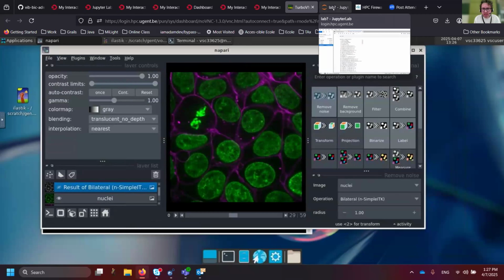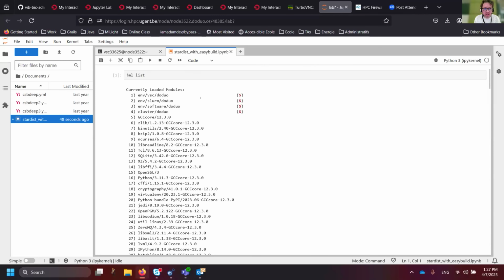Finally, I just wanted to show you one last thing, for those who code a bit or use Jupyter Notebook in Napari. There is a specificity on OpenOnDemand: it's also possible to use packages of applications made with EasyBuild. EasyBuild is a bit like packages on Linux that allow you to package a library or software into one package that you can load directly and then use.